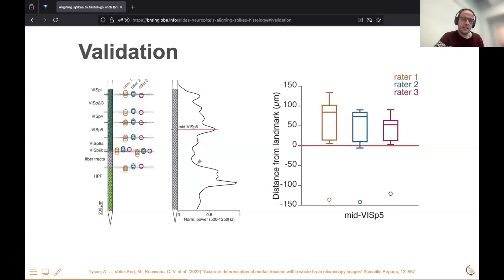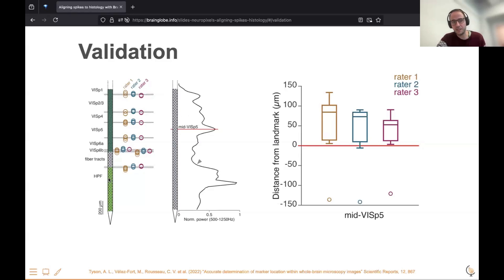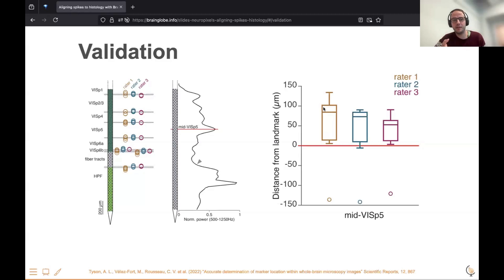It's important to validate your data. In our case we validated it — we had different people annotate the histological data and checked how well it matches the Neuropixels data. You can see that the distance is typically between 50 and 100 microns, which is relatively good, though the way you prepare your sample might affect this. So it's important to validate your data.